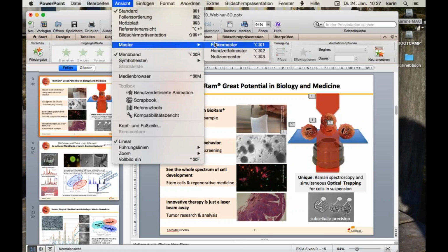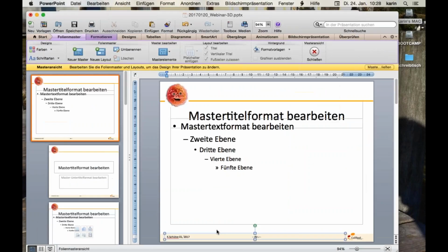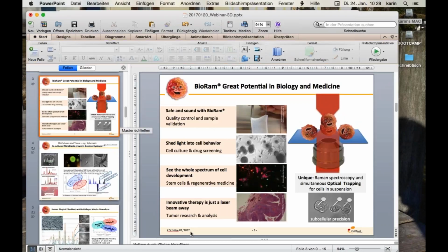Okay, and then one general question was, can you briefly mention the limitations of your technology, if there are any? The limitations of the technology would be, in the case of what I'm talking about now, that samples would be too thick, like a millimeter or so. So usually we go up to 500 micrometers. The limitations regarding the cells is really difficult to say.